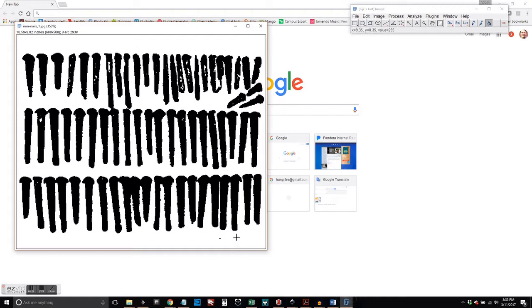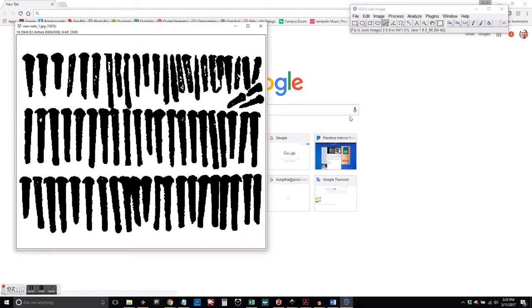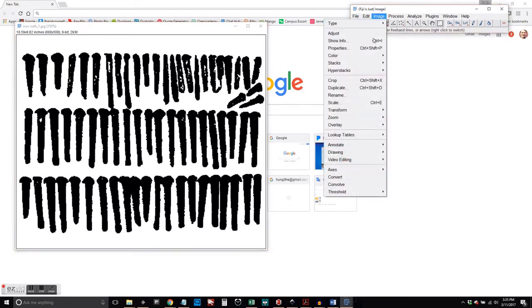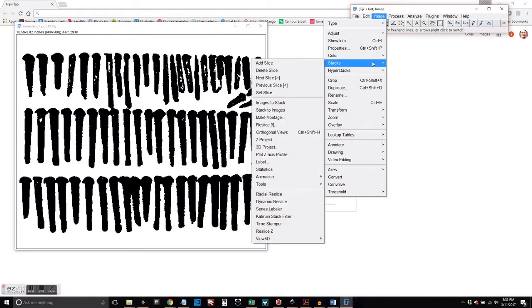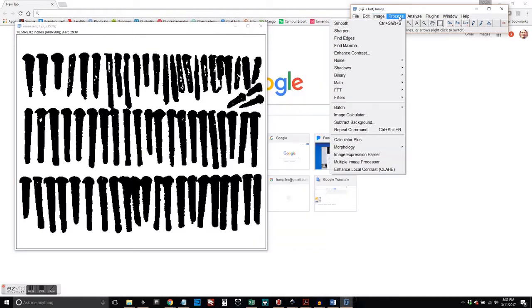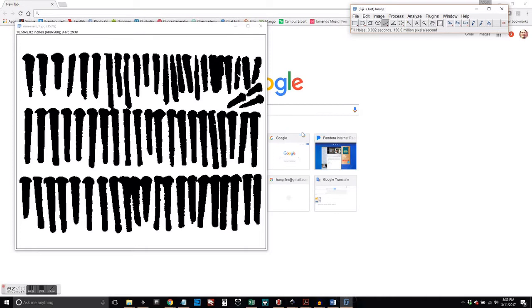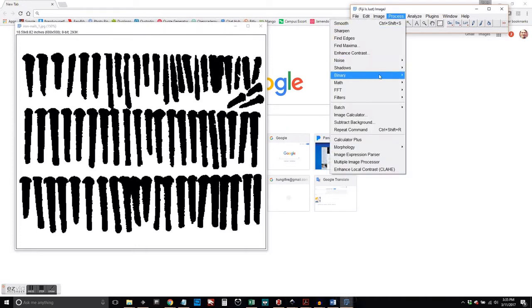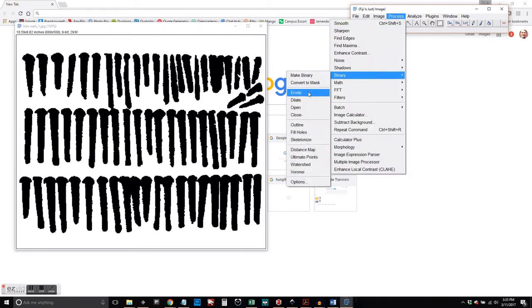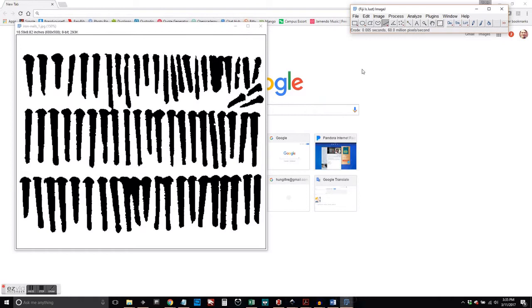And then once we're done with that, we're going to go ahead and we're going to fill in the white spaces within the objects. And then we're going to erode it back to where it was.